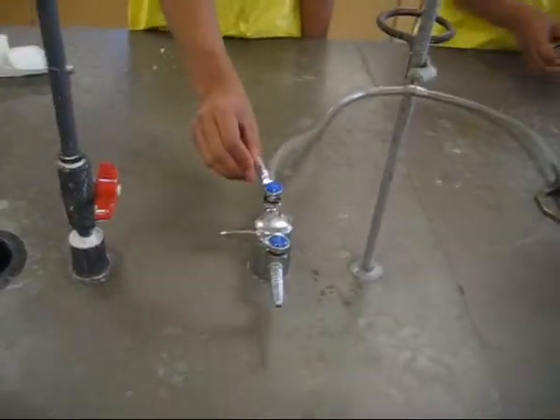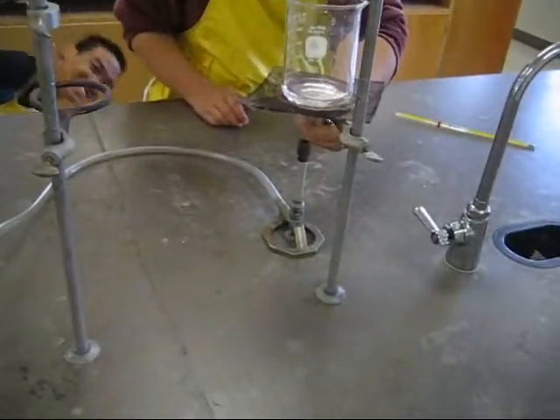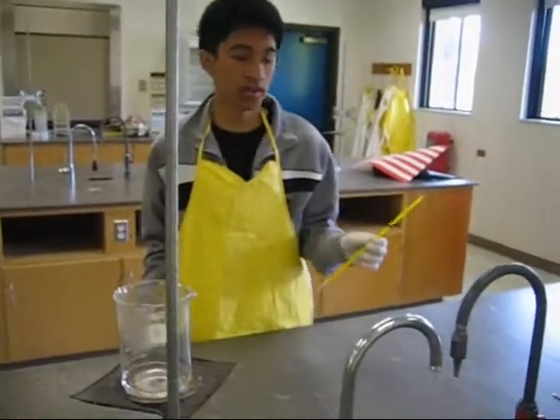Step 1. Turn on the gas. Step 2. Light up the gas. Step 3. Get the water to boiling point.